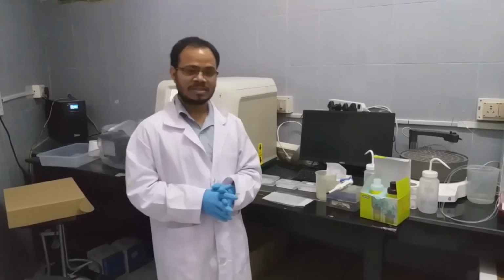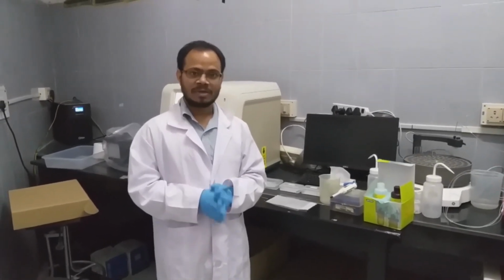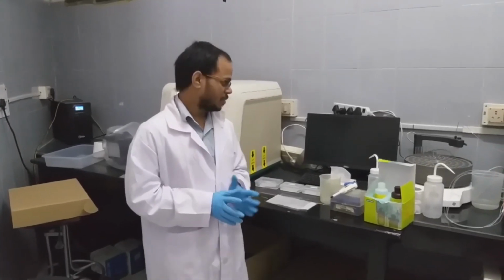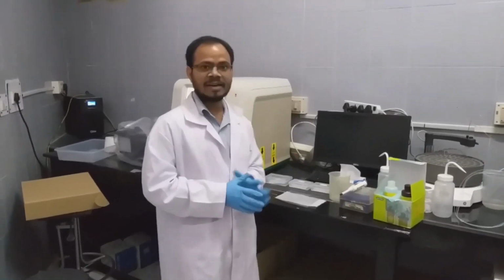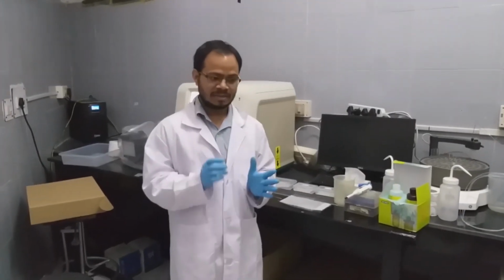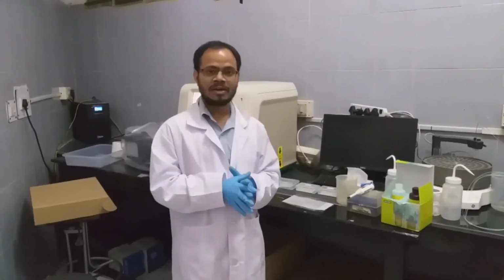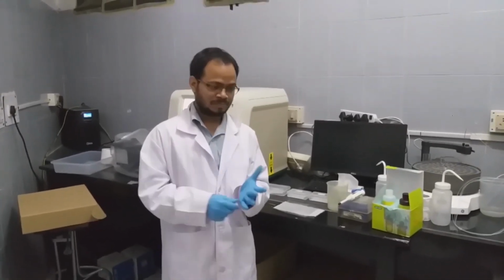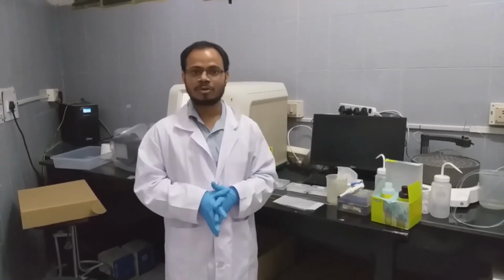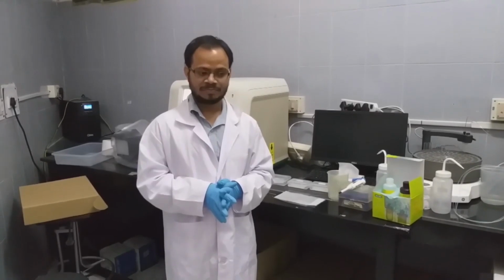Luminol, in the presence of hydrogen peroxide and the peroxidase enzyme present in the horseradish peroxidase conjugated secondary antibody, is converted to excited state luminol by deprotonating and oxidizing it.